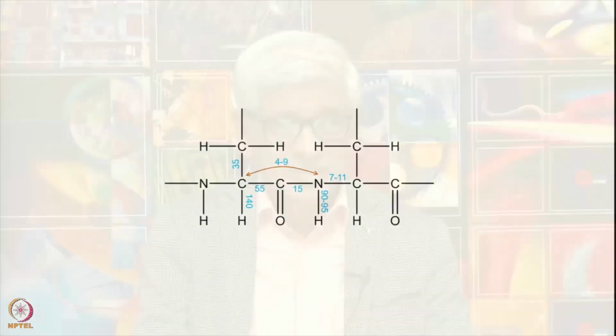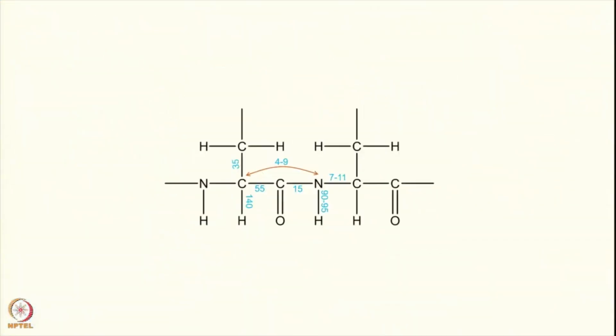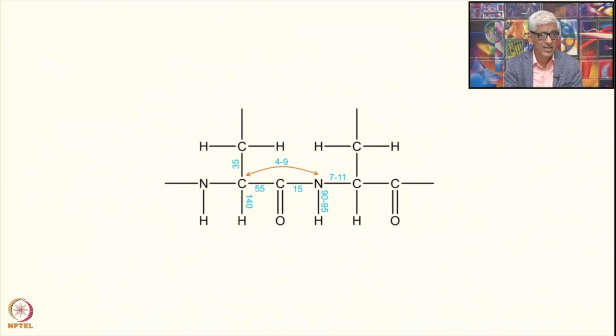Now these experiments are dependent on the transfer pathways, and how does the transfer occur? The transfer occurs through the J coupling, and these are all one bond J couplings, and these numbers are indicated here. The advantage is that these are not dependent on the conformation of your protein and are always the same. Therefore, there is no question of missing a correlation in this kind of experiment.